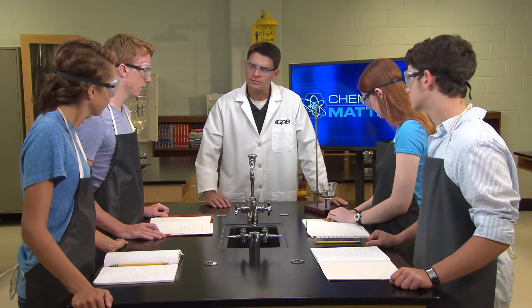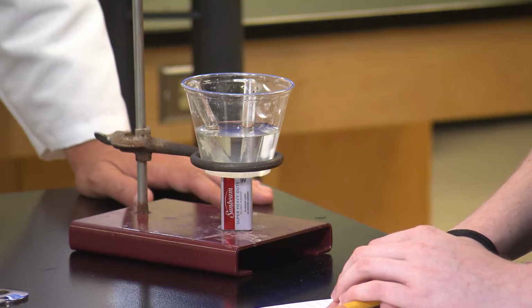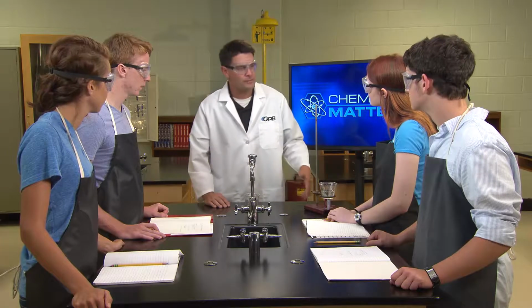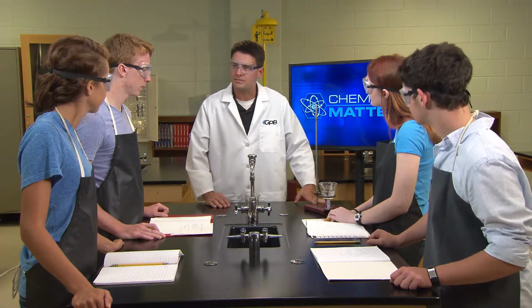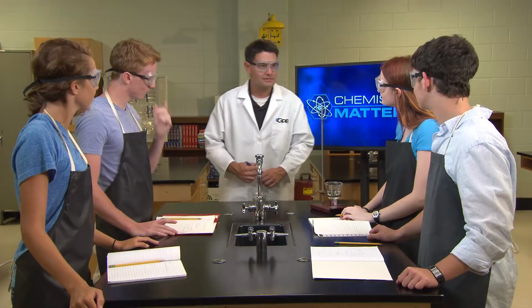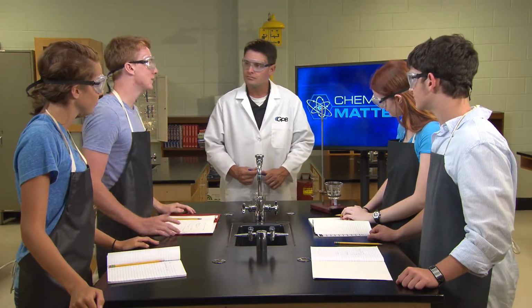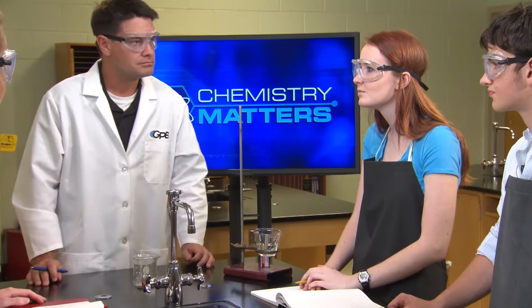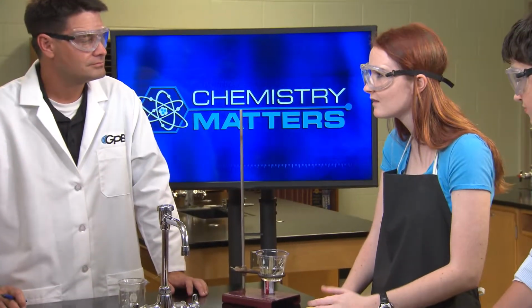So tell me, what do you observe? I see bubbles forming on the tacks. Exactly. Now let's give it a few minutes and we'll come back and make some more observations. Okay, it's been about 5 minutes. Tell me what else you observe. Some water came out of the test tubes. You can see the levels are lower. And one test tube lost almost twice as much water as the other one.